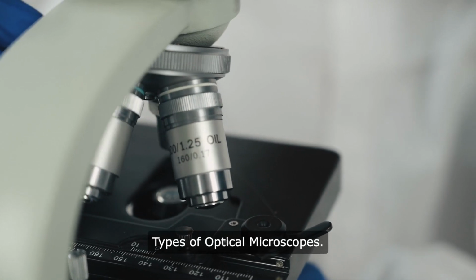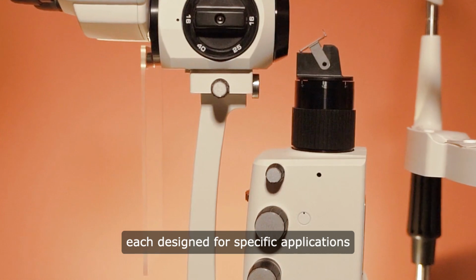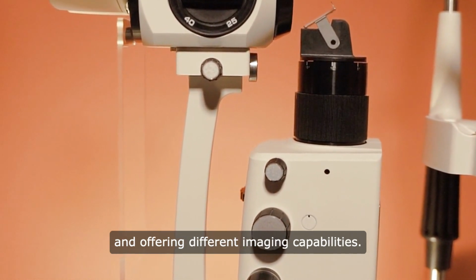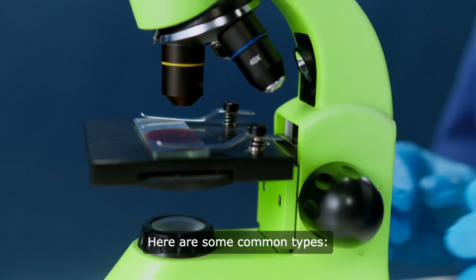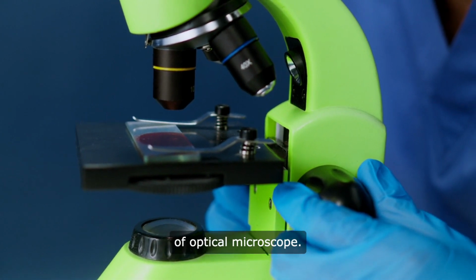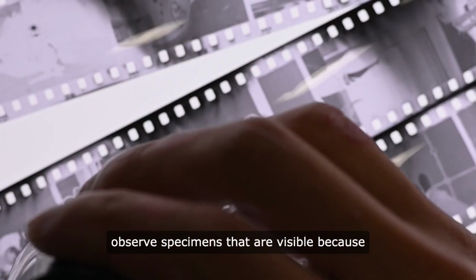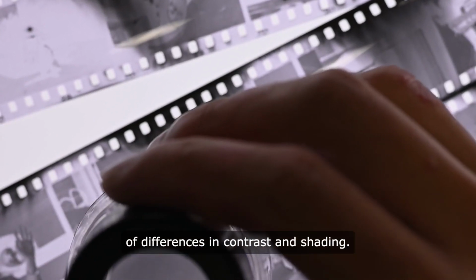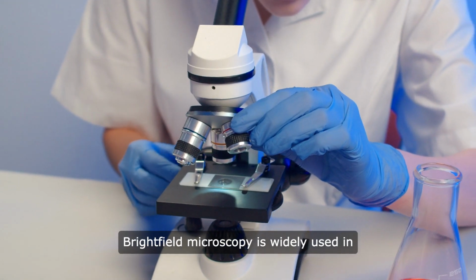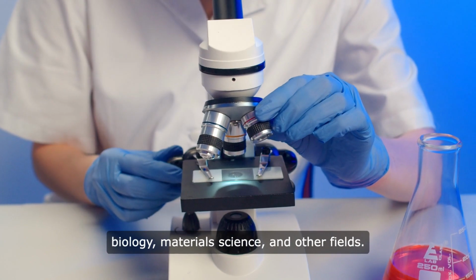Types of optical microscopes. There are several types of optical microscopes, each designed for specific applications and offering different imaging capabilities. Here are some common types. Bright field microscope. This is the most basic type of optical microscope. It uses a bright light source and a simple lens system to observe specimens that are visible because of differences in contrast and shading. Bright field microscopy is widely used in biology, materials science, and other fields.